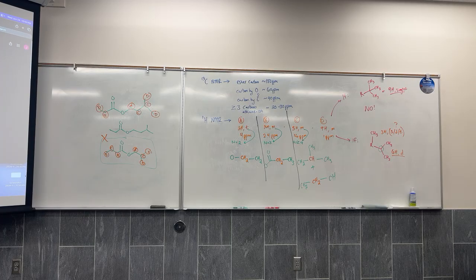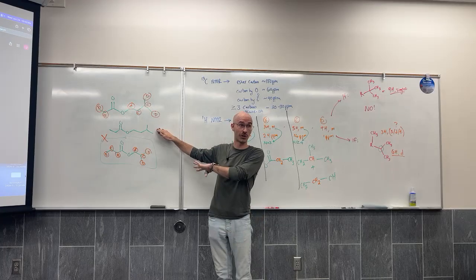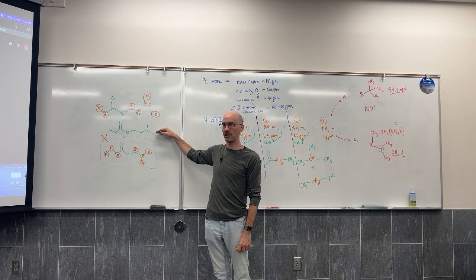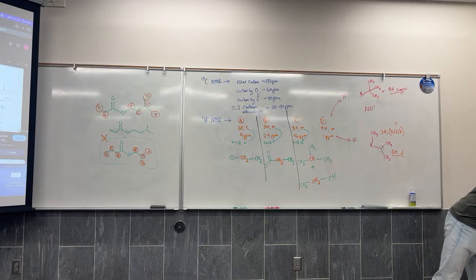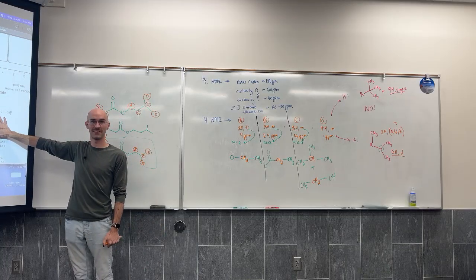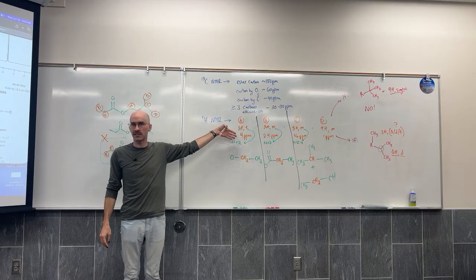So don't blindly go in, because it's going to be so obvious to me. This is much harder than the structures that I will have you solve. If this is the structure I'm expecting, and then you go in there and you give me an aromatic ring with an ester, that makes no sense. We didn't have a signal that was from 6 to 8, so an aromatic ring would not have made sense at all.